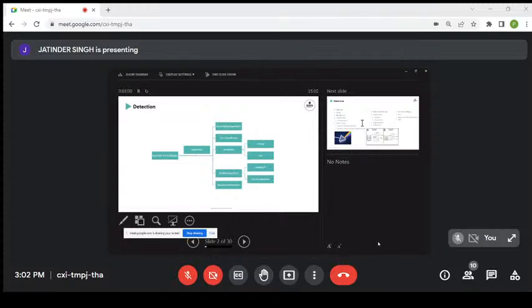Another consideration is if you want to have your detector sitting on the chip or off the chip, and that typically goes hand in hand with how portable you want your system to be. If you want your system to be ready to go in a backpack with you to a lake, you probably like your detector to be integrated rather than having a mass spec lugging behind you. Whereas if you want to do your assay somewhere in a diagnostic lab, then you probably don't care as much if you need to carry a separate box for a detector.